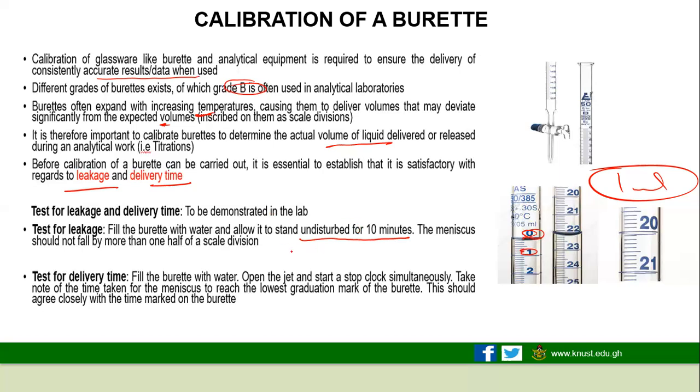Next one, the delivery time. Now, the delivery time would test how the burette will allow liquid to flow through it within a given time. And so for any burette, there is a stated delivery time there, and then usually the delivery time that we measure, we compare it against the manufactured delivery time to show that it is still consistent with the quality of production.